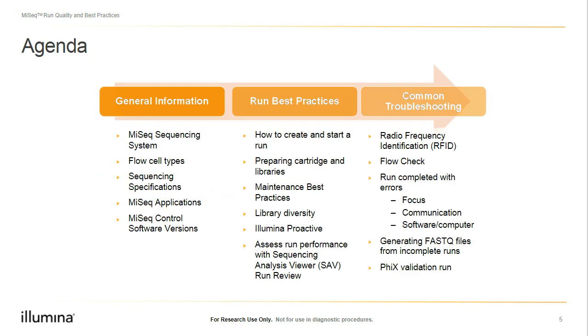Let's quickly cover the agenda for today's presentation. We're going to start with some general information before proceeding to run best practices and common troubleshooting. Before we can jump into the best practices portion, we wanted to cover some basics of the MiSeq system and ensure we have a solid understanding of the system hardware itself. This will include a review of the MiSeq system, various flow cell types which can be run on the MiSeq, the sequencing specifications for the various configurations, some of the common MiSeq applications, and lastly, a quick review of the MiSeq control software versions which you may be running or encounter.